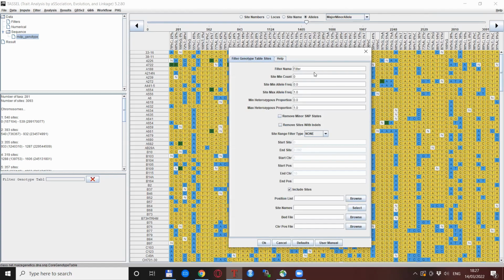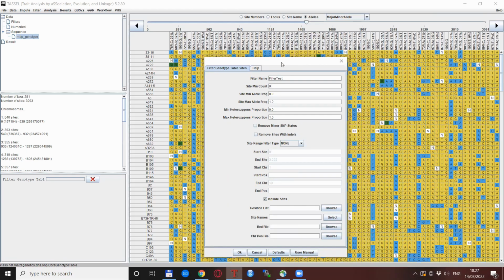So if you don't change anything, these values will be in effect. So if you go there, the first thing is the filter name. So this is just to name the filter setting, which will be then appearing into left side here so that you will see at the end. So we just say test. The second line here is already quite tricky. I mean, it's not that tricky, but it's a bit in software description, it's a bit cumbersome.